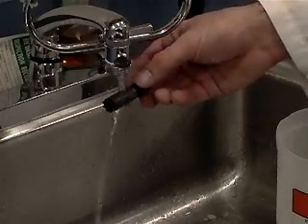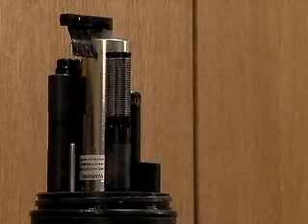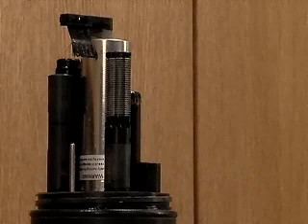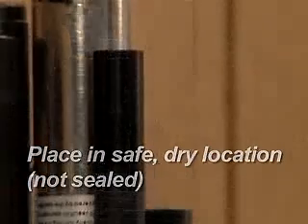Inspect the membrane for damage and for the presence of water inside the tubing. Replace a damaged or waterlogged membrane with Hydrolab part number 003423. If the sonde is going to be stored for longer than two weeks, place the membrane in a safe dry location, not sealed, and leave the protective cap installed on the sensor base.